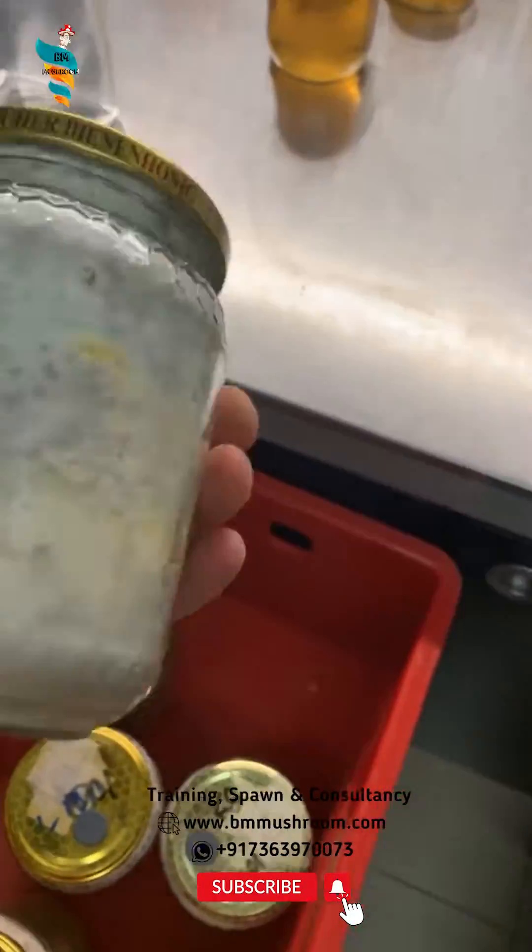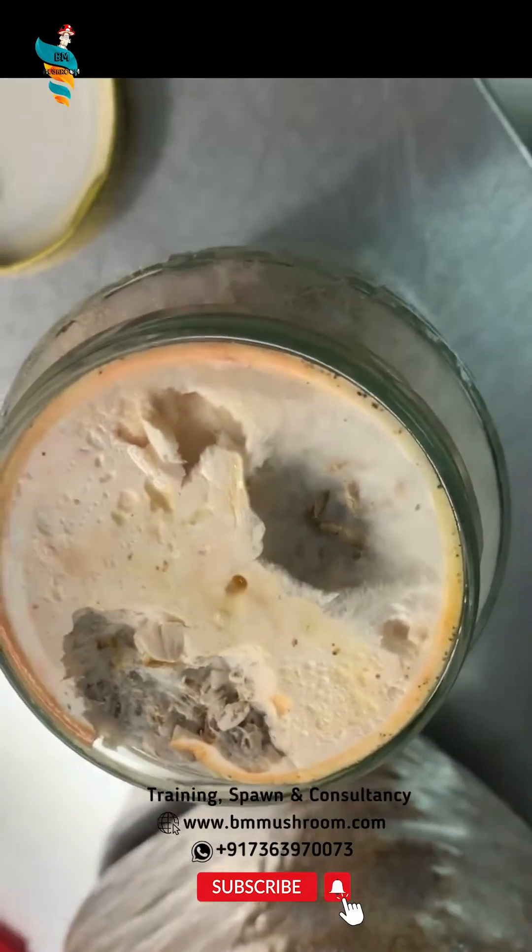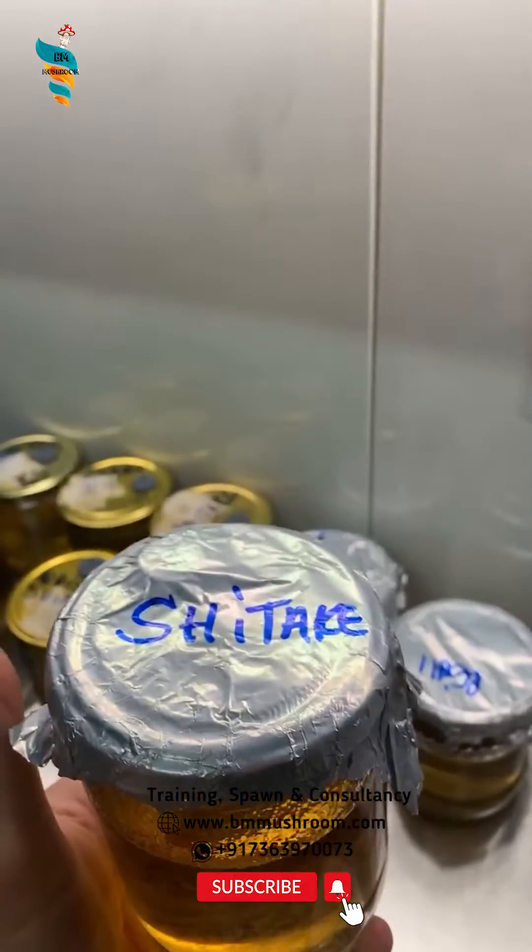Grain spawn is the way to multiply mushroom cultures. Starting from just one liter of sterilized grain and a slice of culture, mycelium can be grown into more than 1,000 liters of spawn.